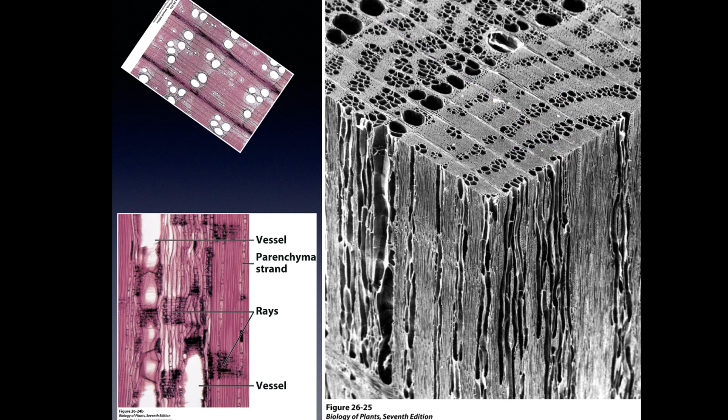And these are parenchyma cells that are helping move nutrients to and from the secondary phloem and the secondary xylem. They're moving products from the phloem over to the developing xylem where it's needed. And most importantly, it's moving water that's being absorbed and taken up from the roots out to the phloem, out to the cambia, and out to all of those other outer cells, all of those other meristematic cells that are in dire need of that water.